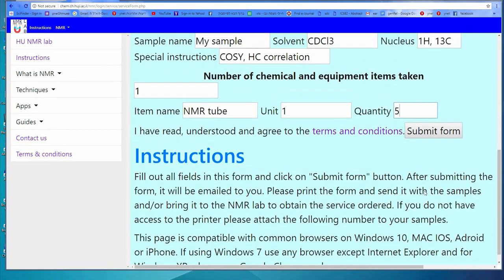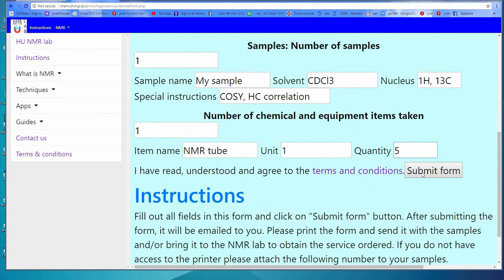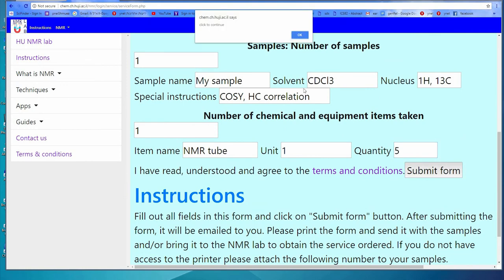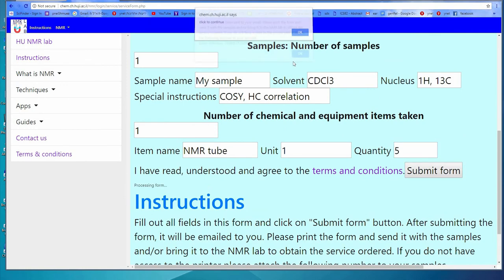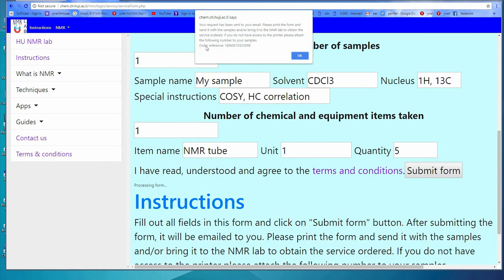You will get an order number that will appear on screen and will be sent to your email. You may either write that order number down and send it with your samples, or print out the form and send it with your samples.